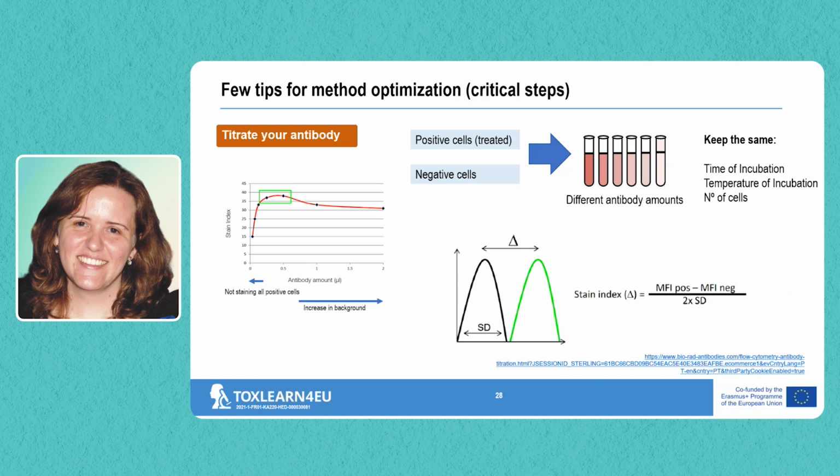And this will help you to know which is the best concentration of the antibody. And you will say, well, the manufacturer has done some tests. They will tell me which is the best amount. Well, he has done that for his conditions, and our conditions are sometimes different. And in fact, most of the time, we can decrease a little bit the concentration, and that will also save us some money, okay?